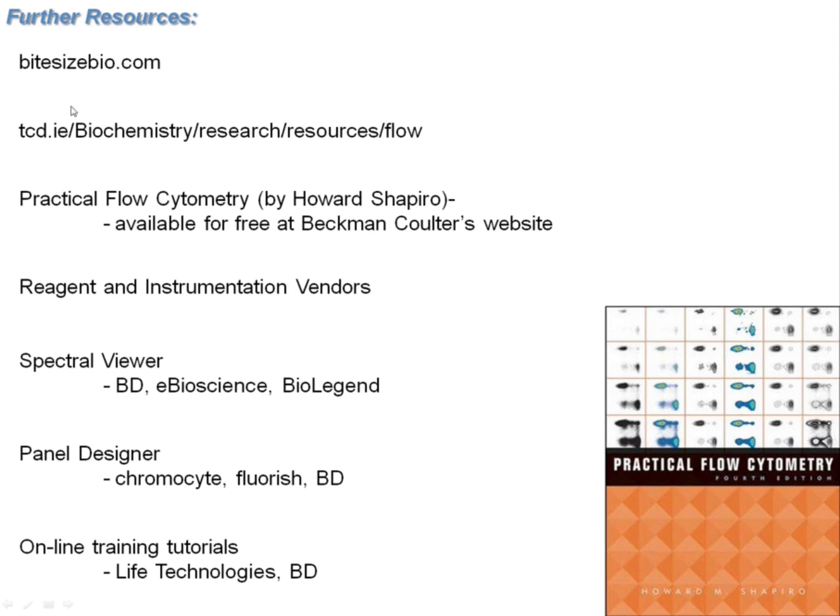The next thing, this is my own website that you're more than welcome to access. The main tome that should be read, the main reference book, is certainly Practical Flow Cytometry by Howard Shapiro, which is really the world authority on all things cytometry. There is a free PDF at the Beckman Coulter website. I find all the reagent websites or instrumentation vendor websites have really excellent resources, particular to their own reagents, but also general reading.